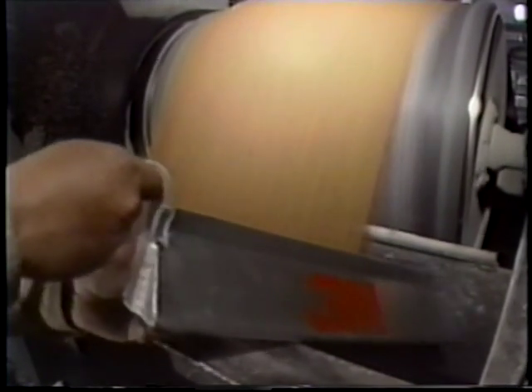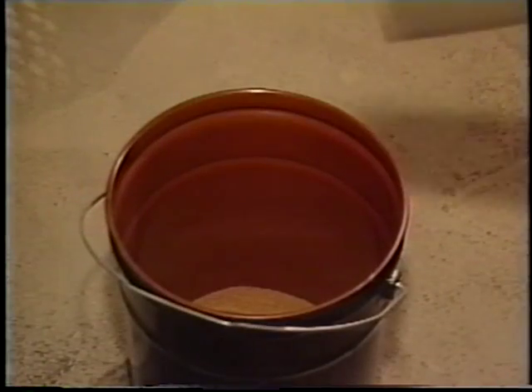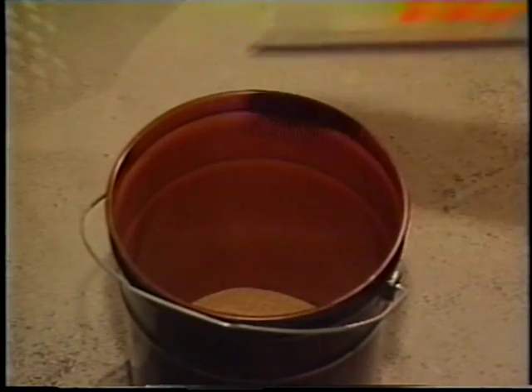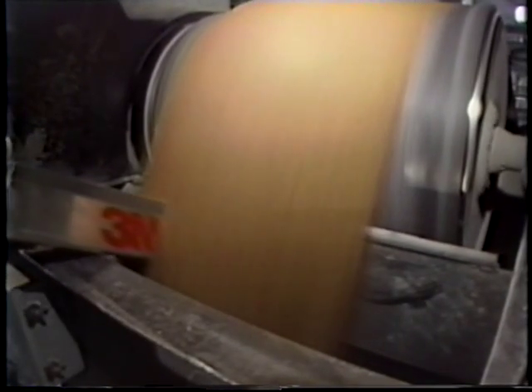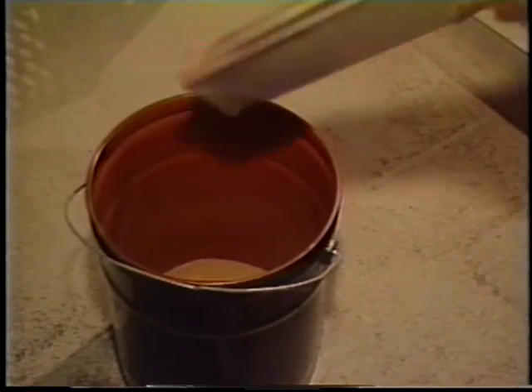Take each cut by passing the sampler slowly through the stream of granules and back again, then empty the sampler into the container. Take the cuts on an equal time basis throughout the unloading to maintain sample accuracy. Taking all the cuts at the same time will destroy accuracy.